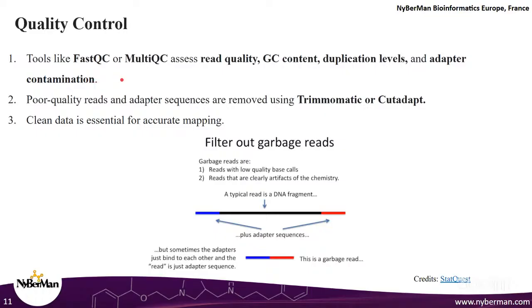I will tell you how exactly read quality is assigned, what is the math behind it, everything. Just a trailer of it for you guys. We use something known as Phred encoding, or Phred scoring. A lot of you might have heard of it, a lot of you might know what it is, so please just bear with me. We will go through all of them in great detail.